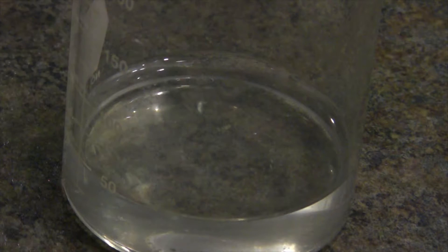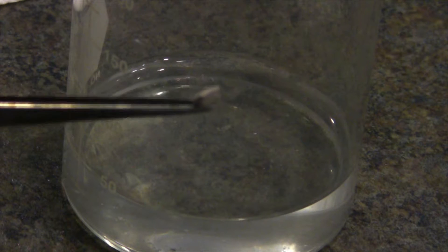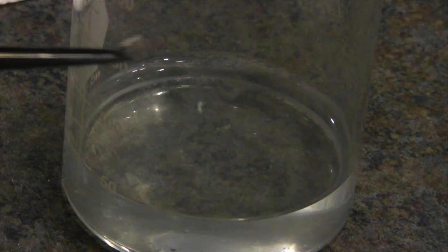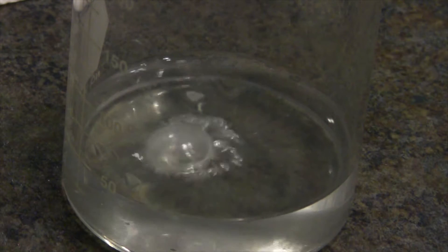I can get my sodium sample out of the jar — there we go. And you'll see that in hydrochloric acid, many metals actually react with hydrochloric acid to form hydrogen. Sodium is particularly reactive with water, and much more so reactive in hydrochloric acid. So you can see our sodium sample and our hydrochloric acid solution, and we'll see it's quite a bit more violent than it is in water.